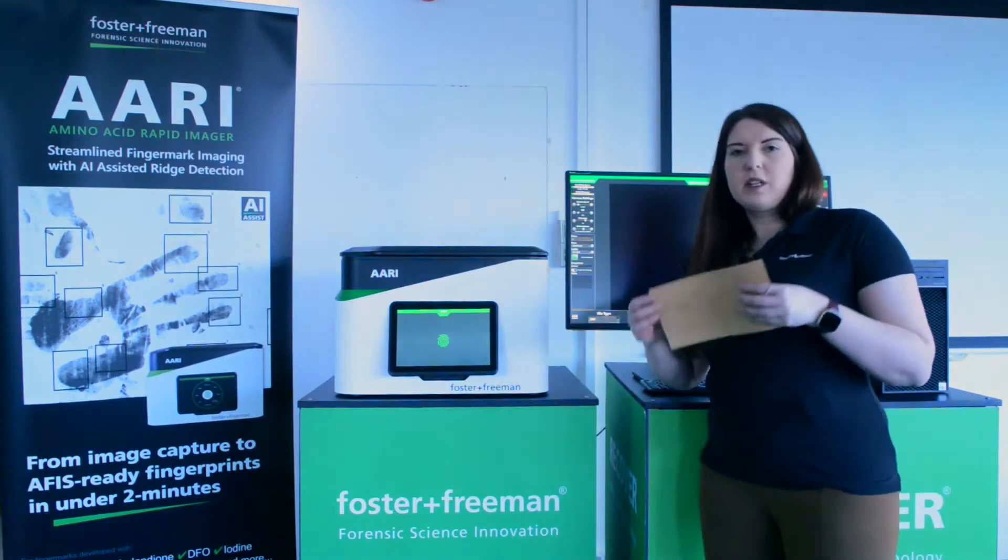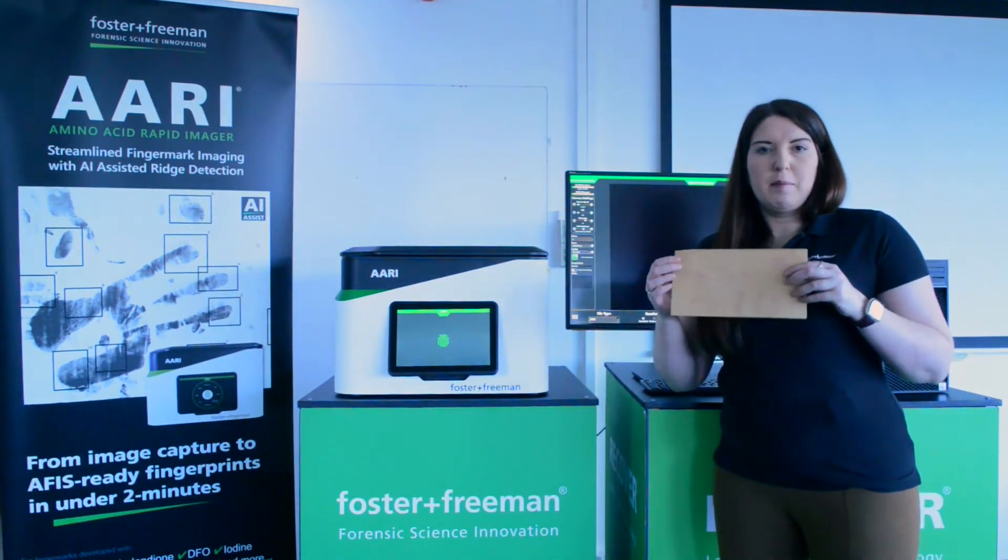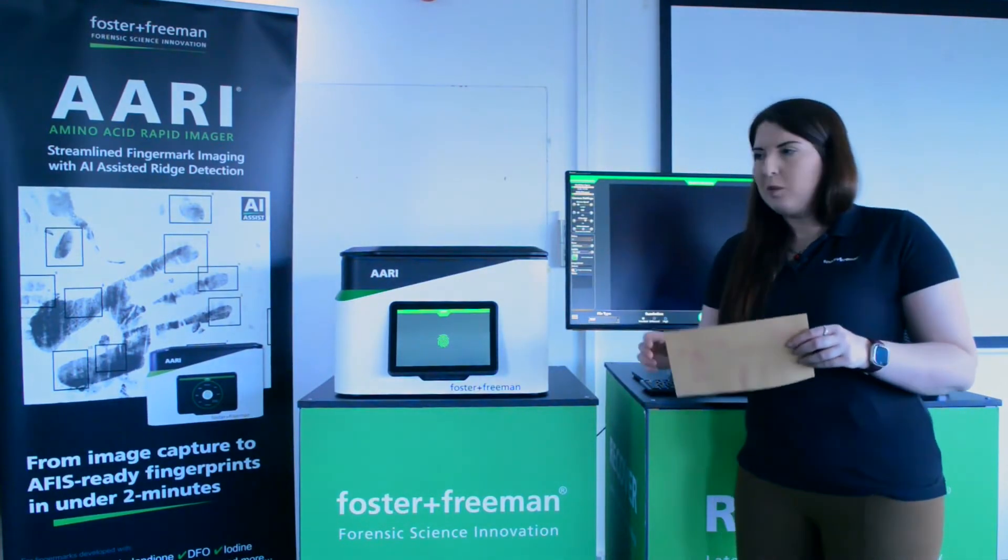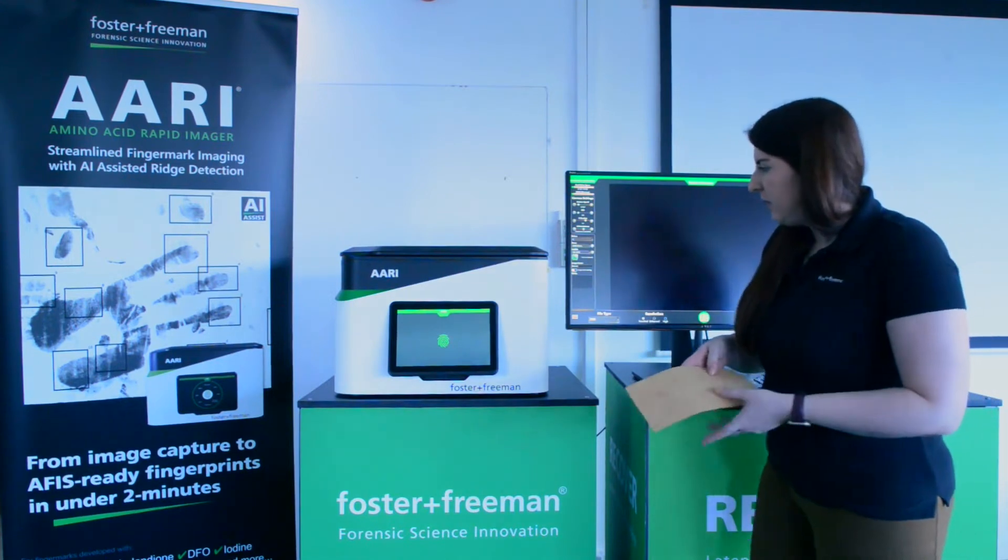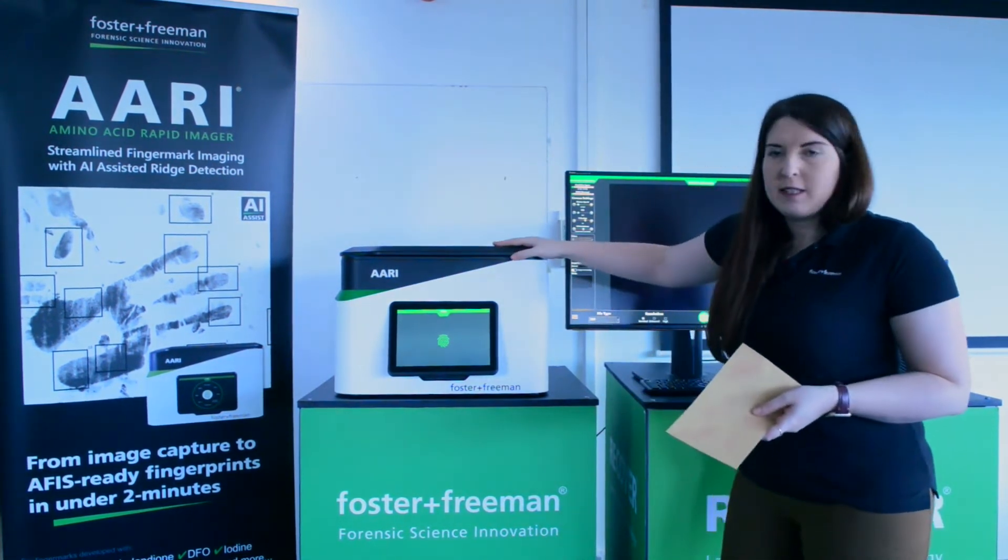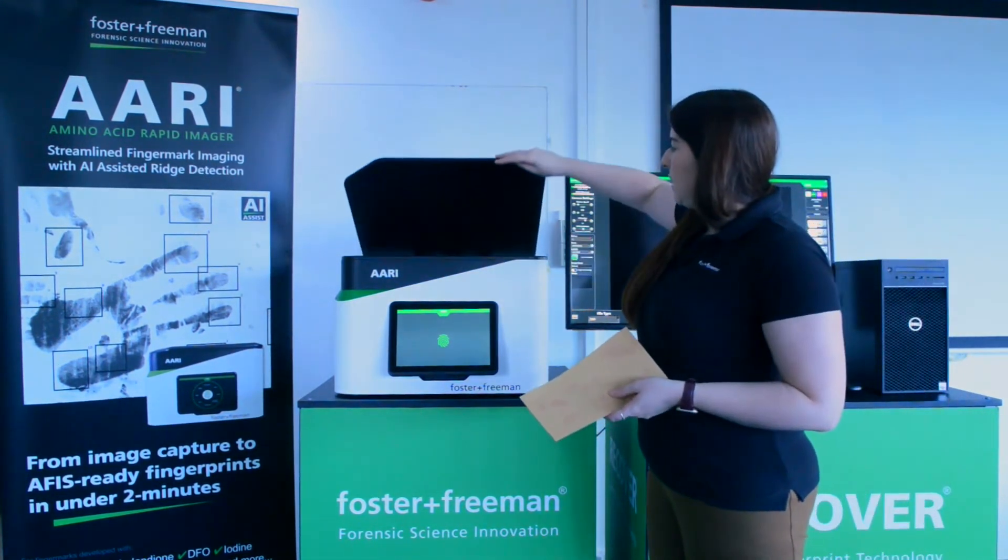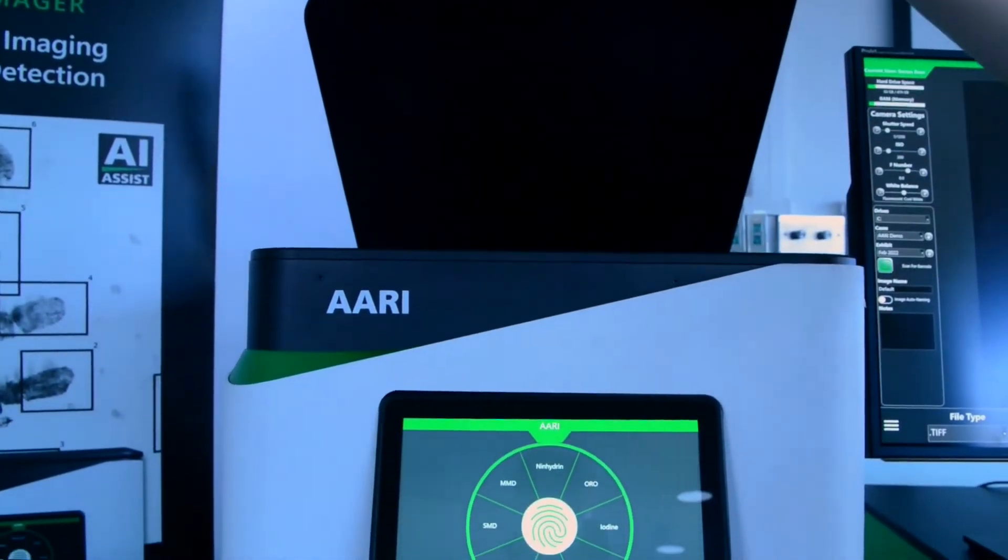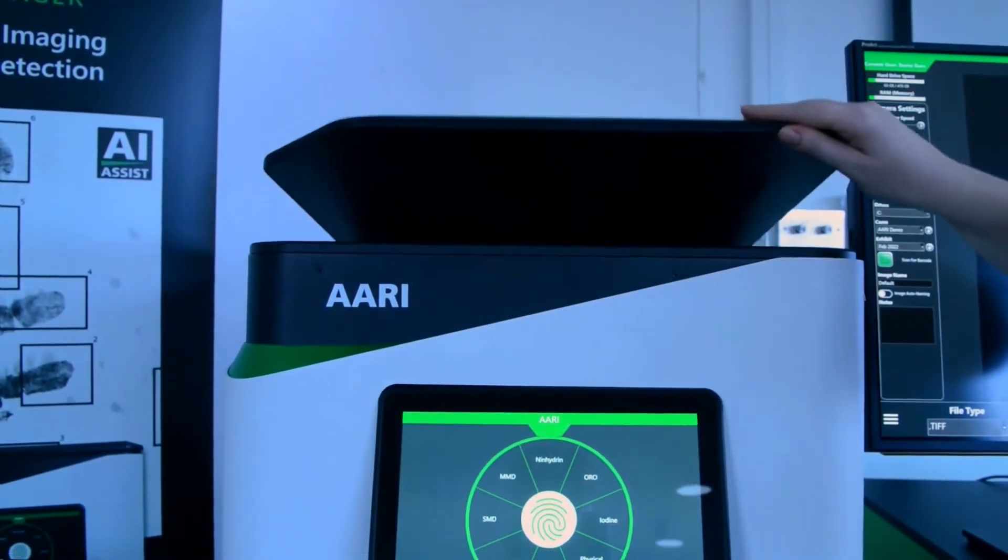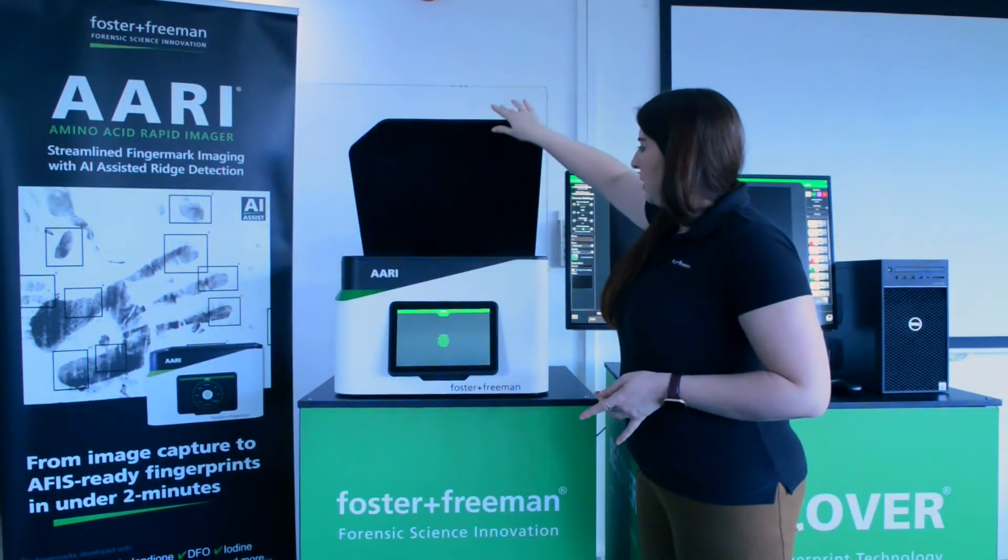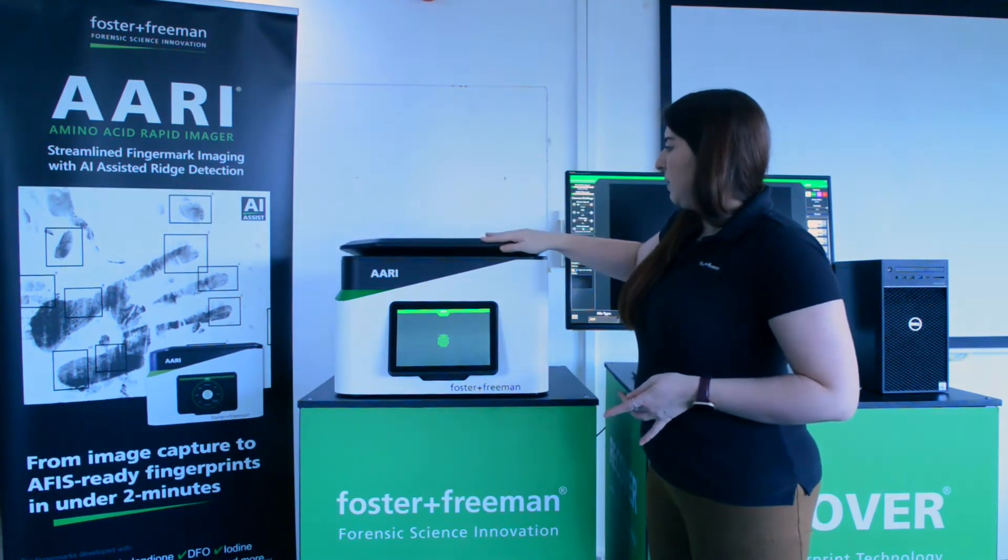So today we're going to use a sample of paper which has been treated with DFO. Here we have our AARI system and it's just a simple case of lifting the lid and placing our evidence onto the glass plate and bringing the lid back down again.